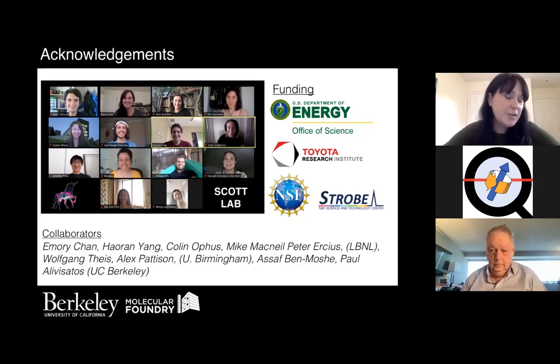And to that end, one thing that I didn't get to talk about today is a collaborative effort to build a fast image generation pipeline, where we hope that we can build tools for researchers to generate reasonable physics-based TEM simulated images on timescales that are not too bad, that can then be used for training data. Because this is a way of generating training data for your problem, again, without having to label.